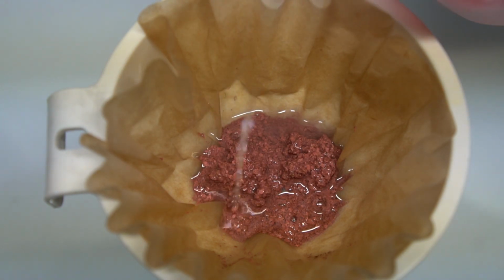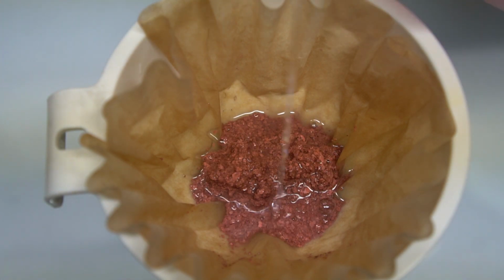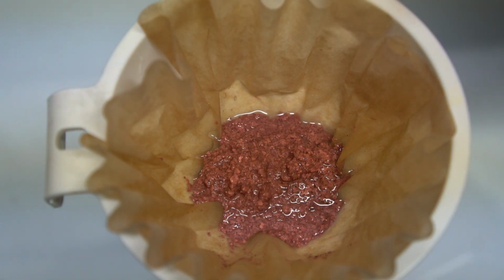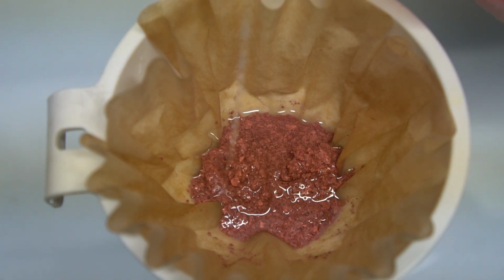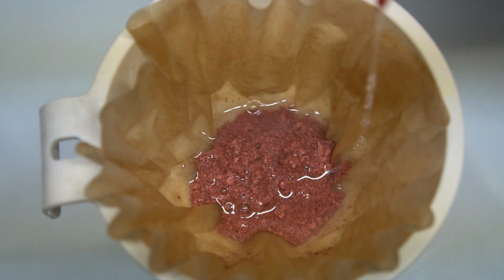aluminum sulfate that's still on there, or sodium chloride. Remember, we added a little bit of salt in there just to allow the copper ions to break through that aluminum oxide passivation layer. And that should be pretty good.